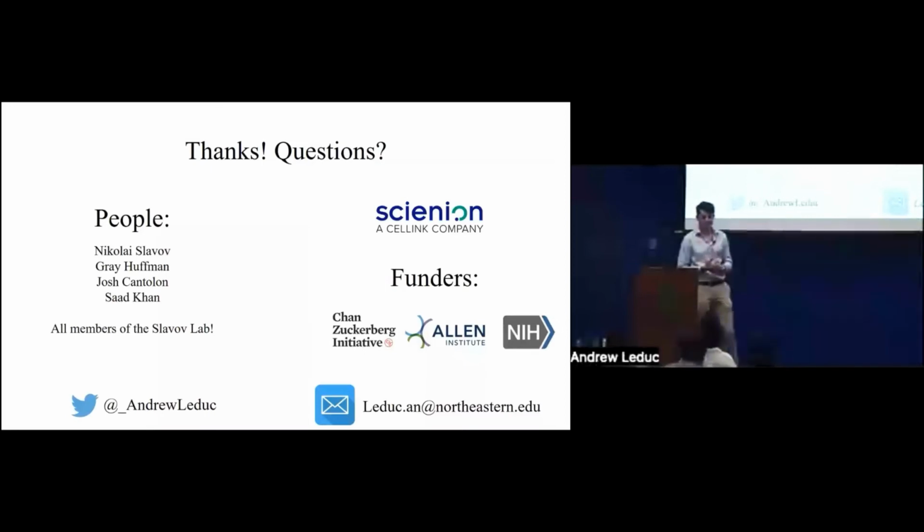Great talk. Thank you, Andrew. To follow up on the previous couple of questions, it seems that there is substantial interest in figuring out and resolving batch-related effects. Can you please elaborate a little bit more on the actual sample processing, how you place sorted cells on the slide? Can you process different types of cells right next to each other to minimize that type of batch effect?